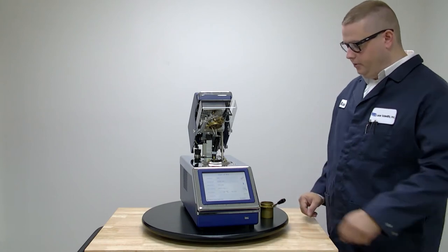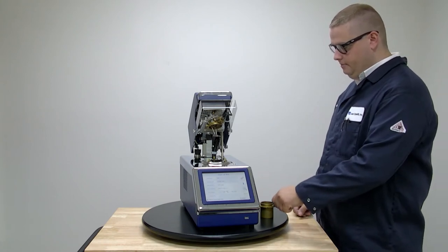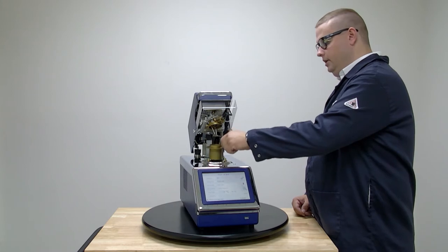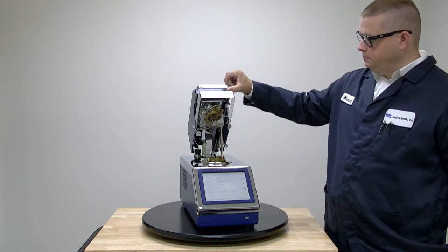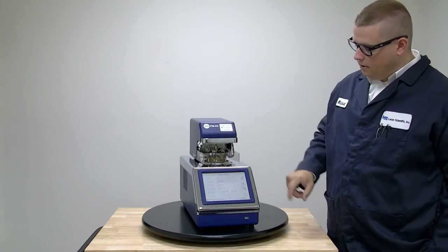At this point we'll take our sample cup, which we filled up with 75 mils of sample. We'll put it into the instrument, close the lid, and press go.